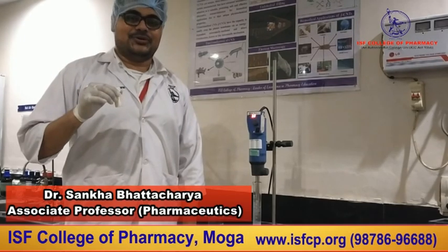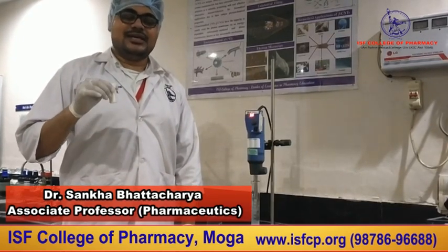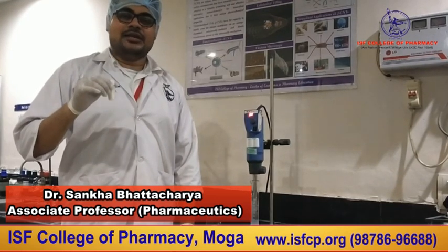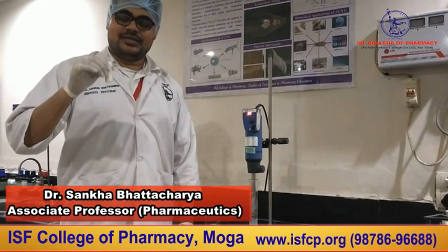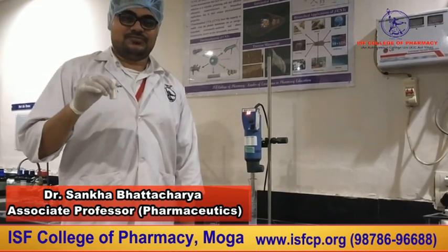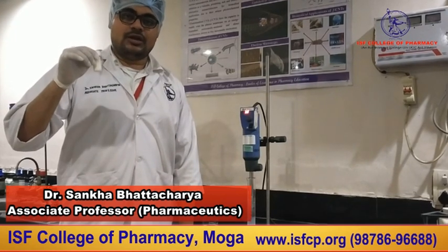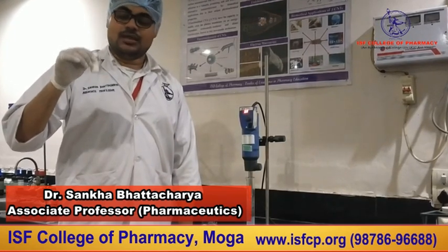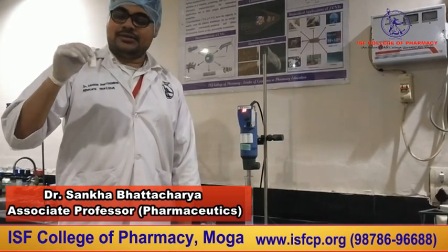Today, we will be learning about nano-emulsion. As you know, pharmaceutically, nano-emulsions are booming right now. Nano-emulsions are basically a biphasic dosage form. In this preparation, we use cholesterol, soy lecithin, chloroform, oleic acid and water.